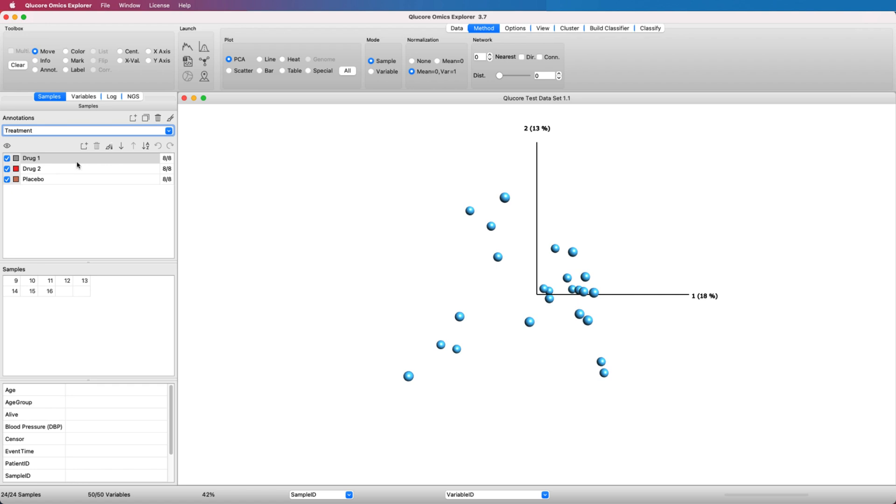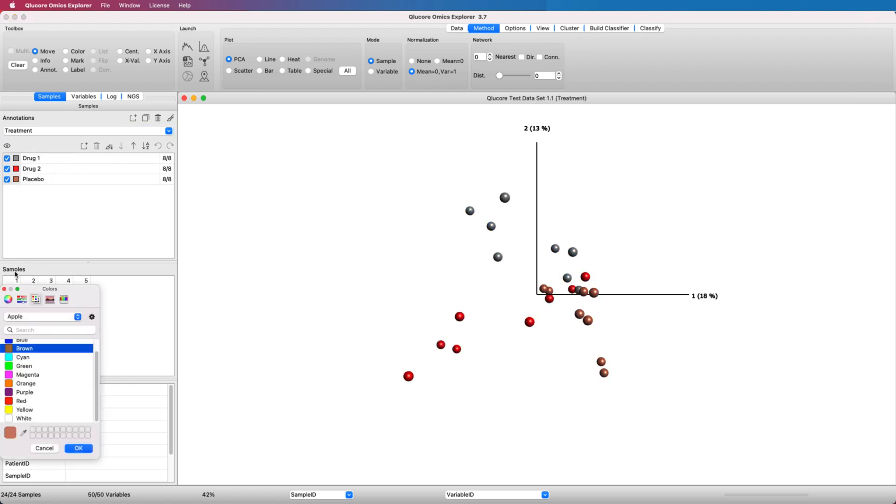Color the plot to see the groups. Change the color of the placebo group to yellow by double-clicking in the color box.